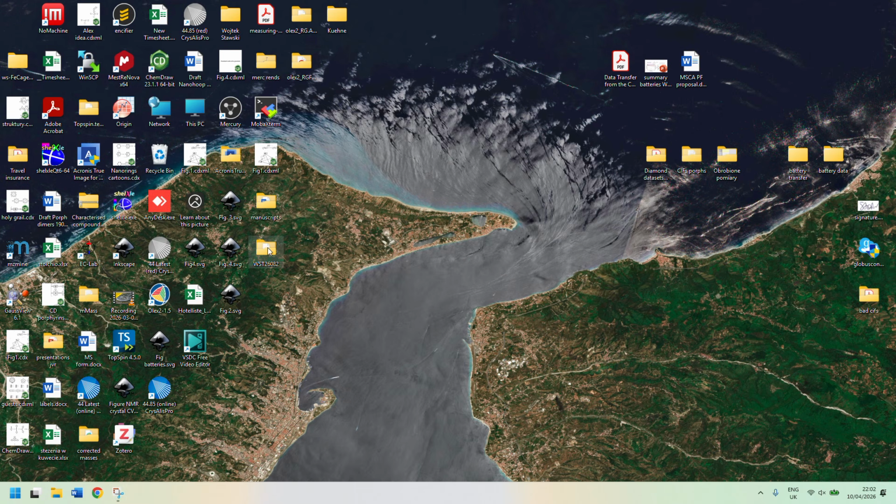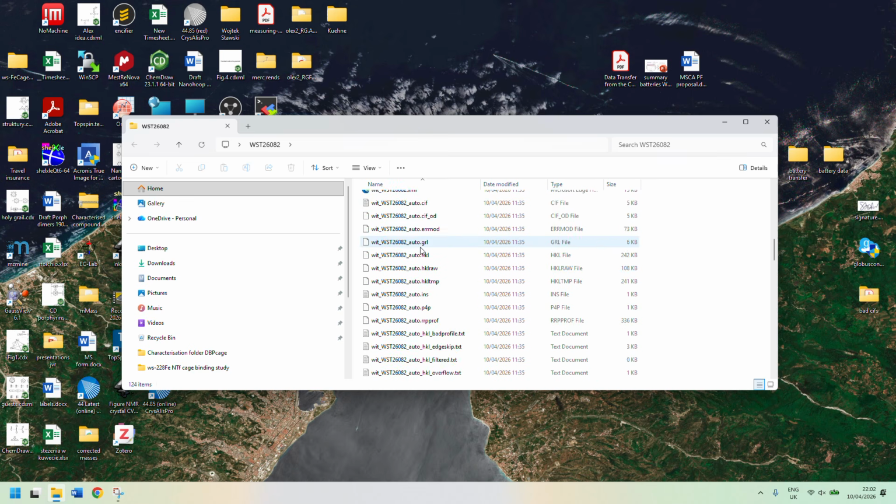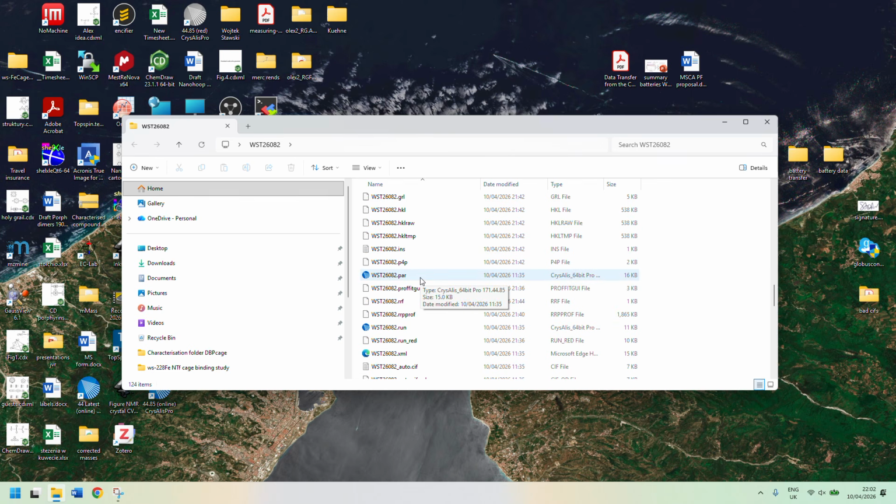I'm going to go to the folder right now that you can download, and we'll go for the parameter file. It's a non-complicated molecule. It's one of the reagents that I used during my synthesis recently, but I noticed that it's not in the database and it magically crystallized, forming okay-ish crystals from an oil that I obtained after synthesis. After some time, I thought, yeah, why not? Let's put it into the database if it's not there.